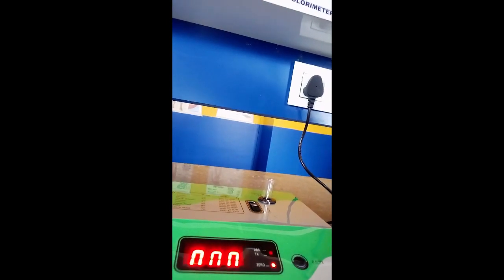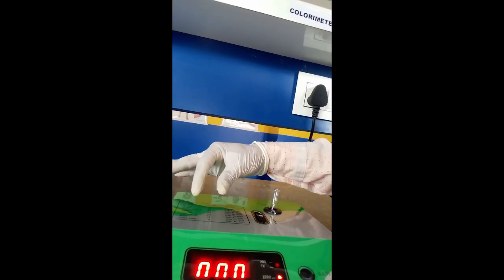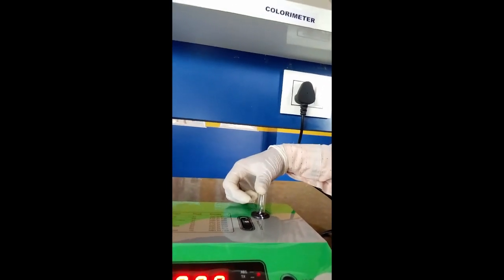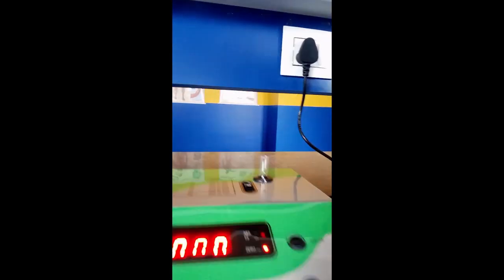So this is all about the digital photometer. As I told you, there is a light source, after that there is a filter, and there is a cuvette, and this cuvette of solution will absorb the light, and the remaining light will fall on the photocell, which will give you the readings. So this is the actual inside and outside of the colorimeter.